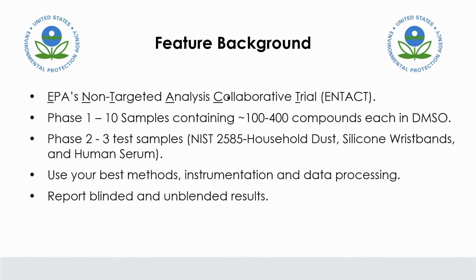I won't go too much into the details of the various phases here, but basically you were required to analyze some samples without understanding or any knowledge of what was in them, and you had to report back the peaks that you'd found and then assign a confidence value to those identifications.